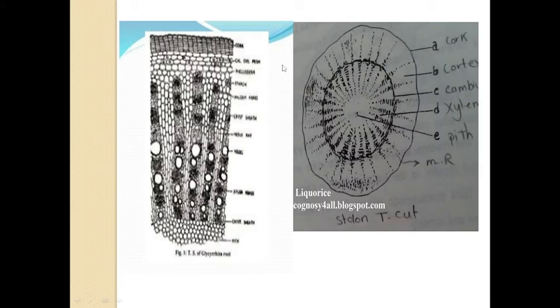When we take the transverse section of licorice root or runner, it shows presence of secondary thickening and the epidermis and cortex portion is absent.